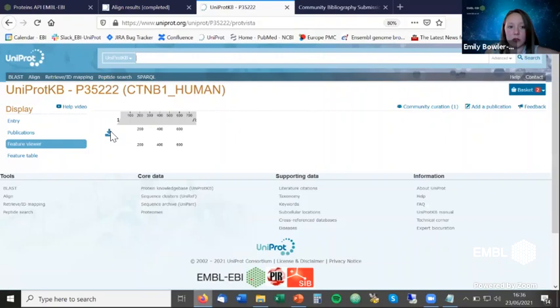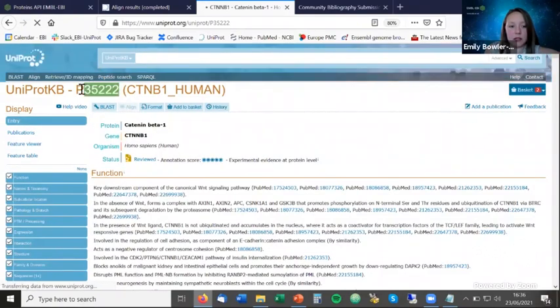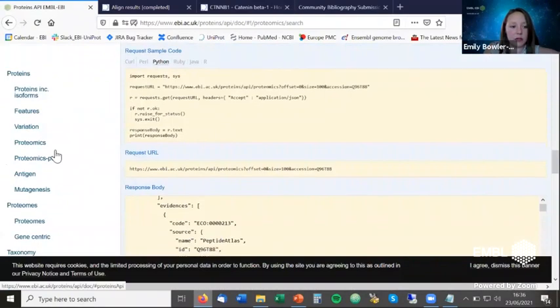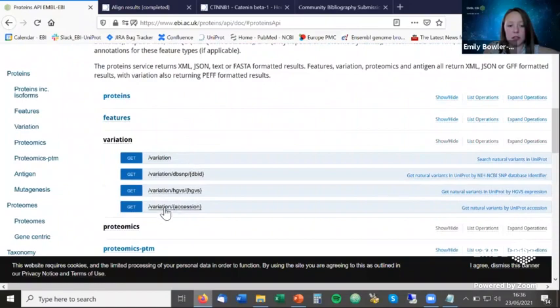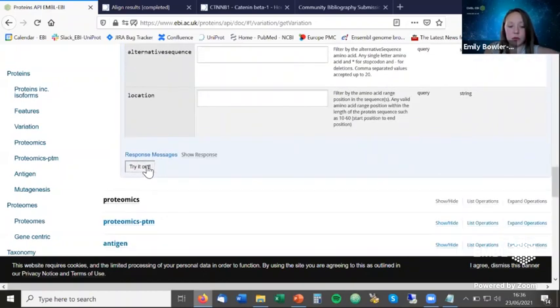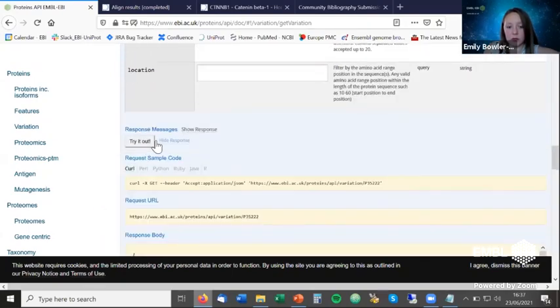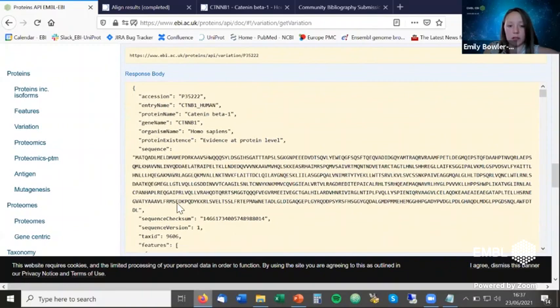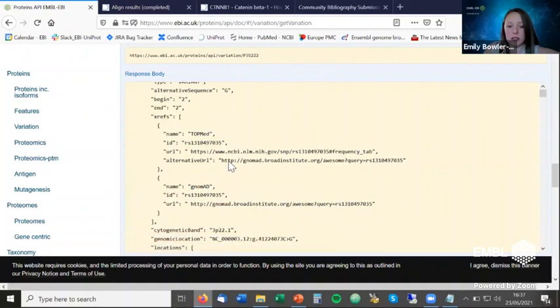Using the variation API with an accession ID, you get back the amino acid sequence and then each variant — for example, a variant at position 2 with alternative amino acid G and an RS ID indicating it is an SNP — along with its source and other details.